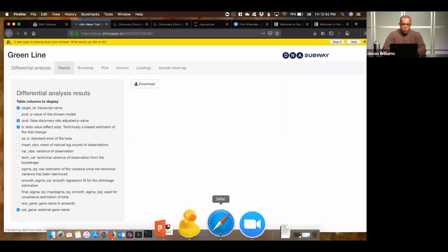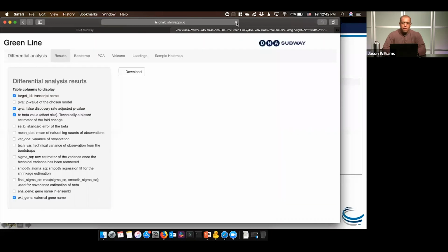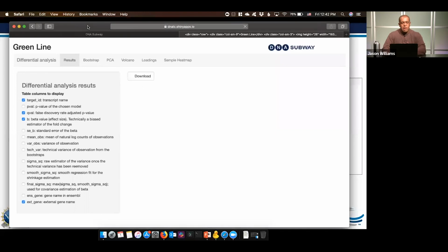Let me go ahead and load one. I'm going to have to reconnect to it. But theoretically, and I notice it's a bit browser specific, because on the Safari browser, it seemed to work really, really quickly. So give it a second. But the idea here is a couple-fold. So let me explain that while that is loading.